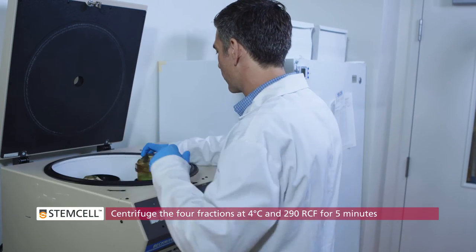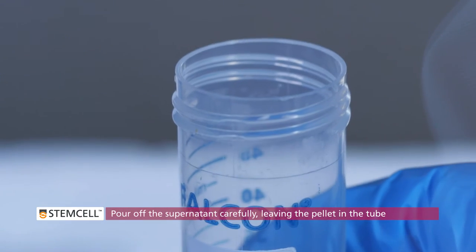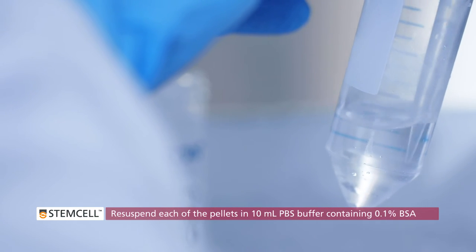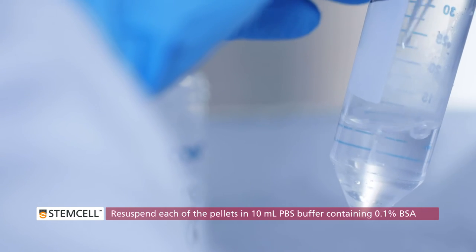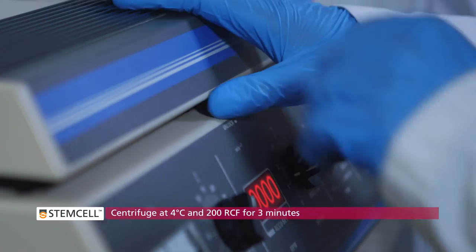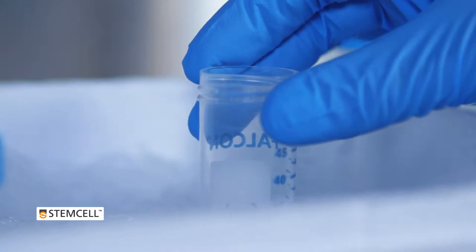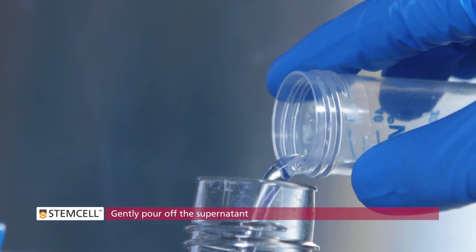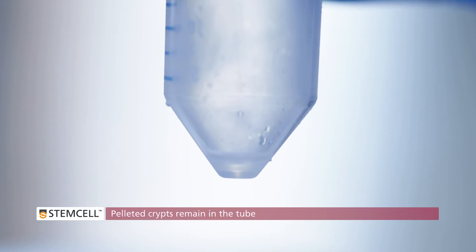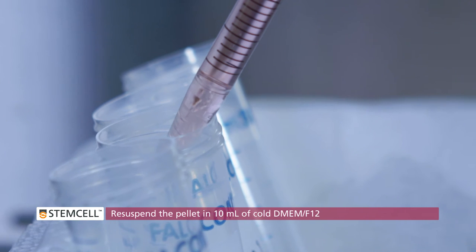Centrifuge the 4 fractions at 4 degrees Celsius and 290 RCF for 5 minutes. Pour off the supernatant carefully, leaving the pellet in the tube. Re-suspend each of the pellets in 10 mL PBS buffer containing 0.1% BSA and transfer to new 15 mL conical tubes labeled with the appropriate fraction number. Centrifuge the 4 fractions at 4 degrees Celsius and 200 RCF for 3 minutes. Single intestinal epithelial cells will not be pelleted and can be poured off with the supernatant. What remains in the tube will be the pelleted crypts.